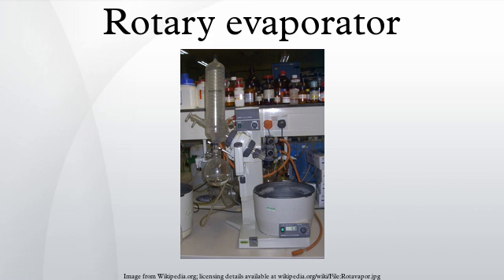The vacuum system used with rotary evaporators can be as simple as a water aspirator with a trap immersed in a cold bath, or as complex as a regulated mechanical vacuum pump with refrigerated trap. Glassware used in the vapor stream and condenser can be simple or complex, depending upon the goals of the evaporation, and any propensities the dissolved compounds might give to the mixture. Commercial instruments are available that include the basic features, and various traps are manufactured to insert between the evaporation flask and the vapor duct. Modern equipment often adds features such as digital control of vacuum, digital display of temperature and rotational speed, and vapor temperature sensing.